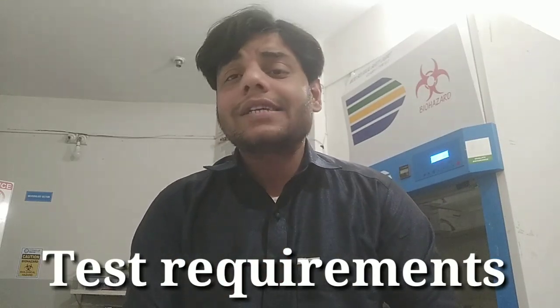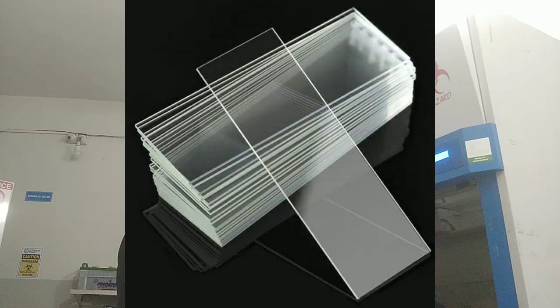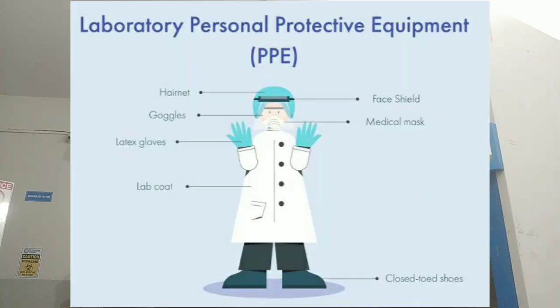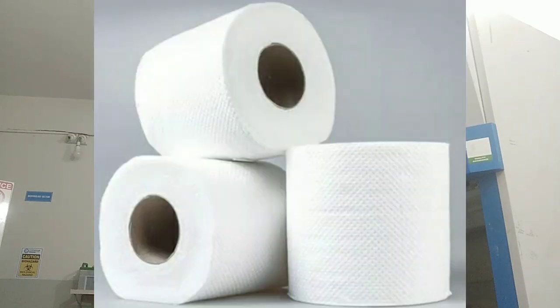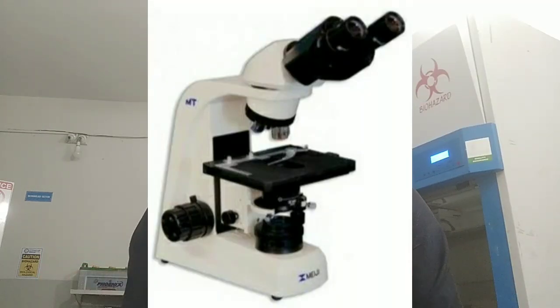Now let's see the test requirements, what we need when we are performing this technique. We need a clean slide, a wire loop, a bacterial culture, personal protective equipment, Albert solution A, Albert solution B, tissue paper, oil immersion, and a microscope as well. So these are the most important materials that we need in this technique. Now let's see the procedure.